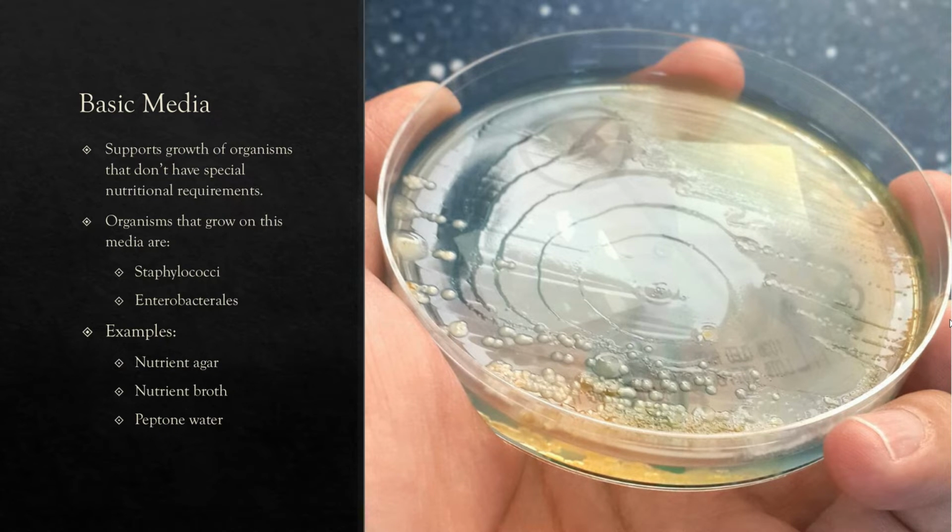The difference between nutrient broth and nutrient agar is that the concentration of agar in the liquid medium, that is nutrient broth, is less than that of nutrient agar. This is the only main difference between broth and nutrient agar. Nutrient agar is actually the base of blood agar and chocolate agar.